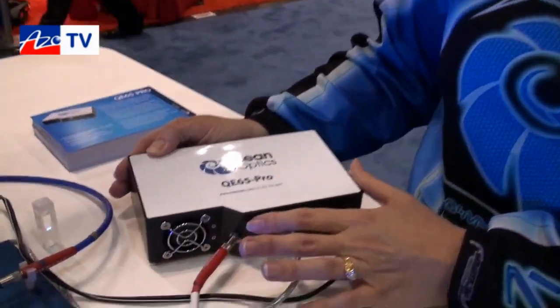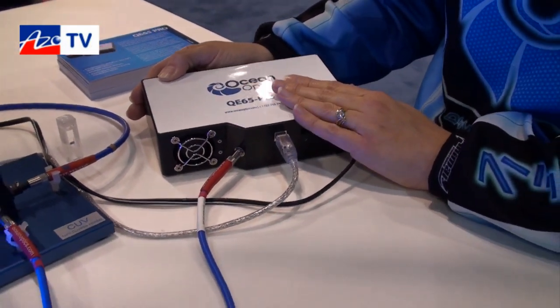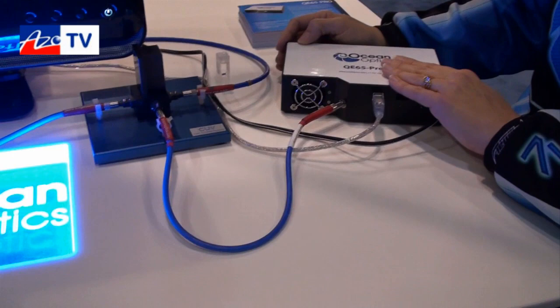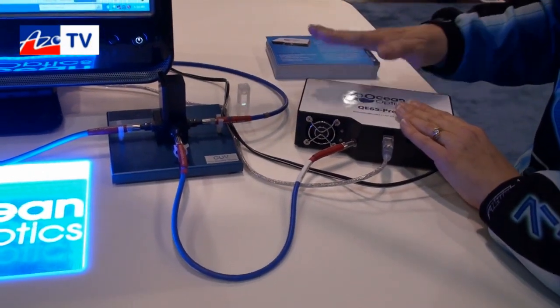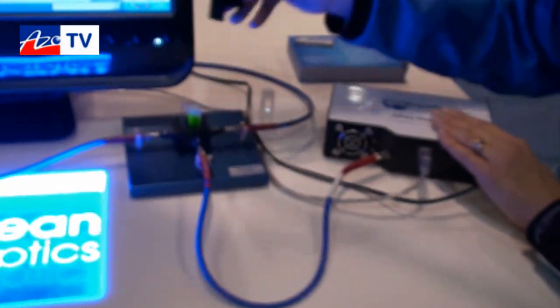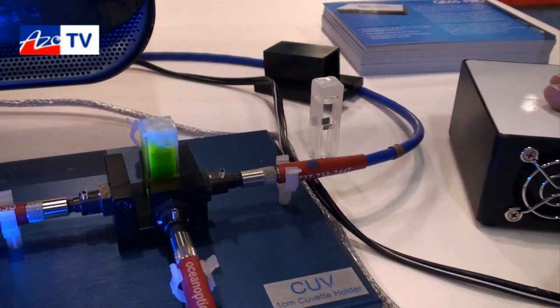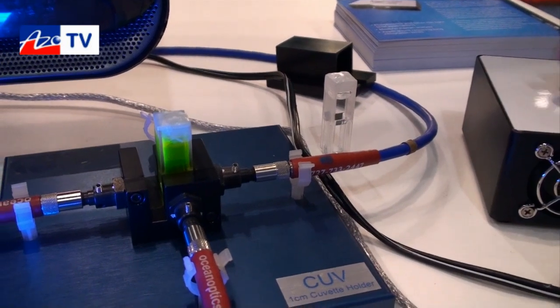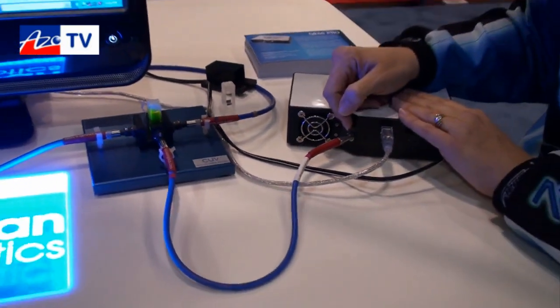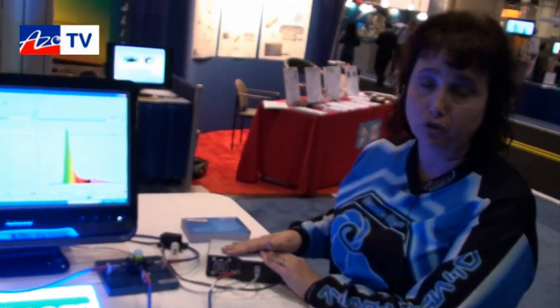Now we've taken the Raman instrument I just showed you, put a larger slit on it — which we can do in our own laboratory — and configured it for fluorescence measurements. The exact same spectrometer just used for Raman can also be used for your fluorescence measurements. What we have here is our QE65 Pro coupled to our four-way cuvette holder, making a fluorescence measurement using a broadband light source with this exact same spectrometer. The benefit is that with this added configurability you can interchange the slits and have one spectrometer for multiple purposes.